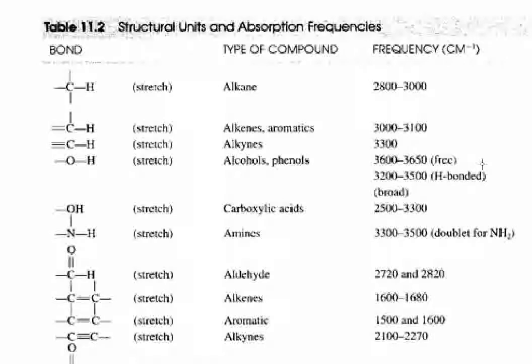And one other thing to note, if we are talking about the actual peak signal for an infrared spectrum corresponding to absorption by the OH stretching frequency, two things to pay attention to are the size of the peak and the broadness. Typically, an OH peak in the IR spectrum is broad. They're some of the broadest peaks that we will see among all the peaks.